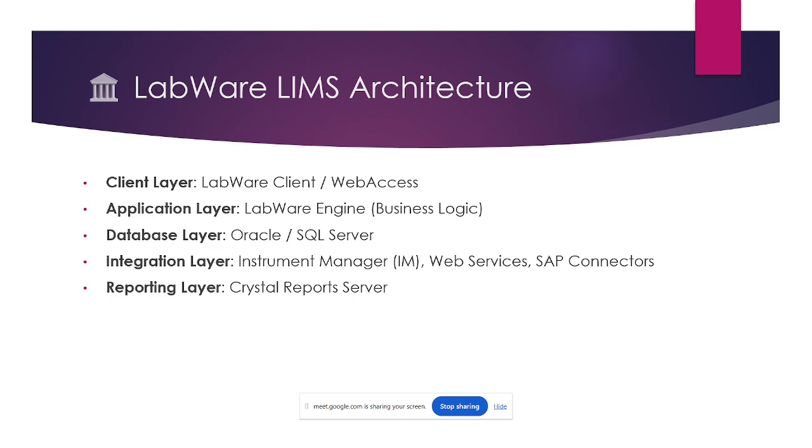And then the reporting layer, that is the Crystal Reports server. After completion of the data, we need to generate the Crystal reports, like COAs, which we call Crystal Reports in the backend. So the Crystal Reports layer will be helpful for the creation of the COAs or reports.